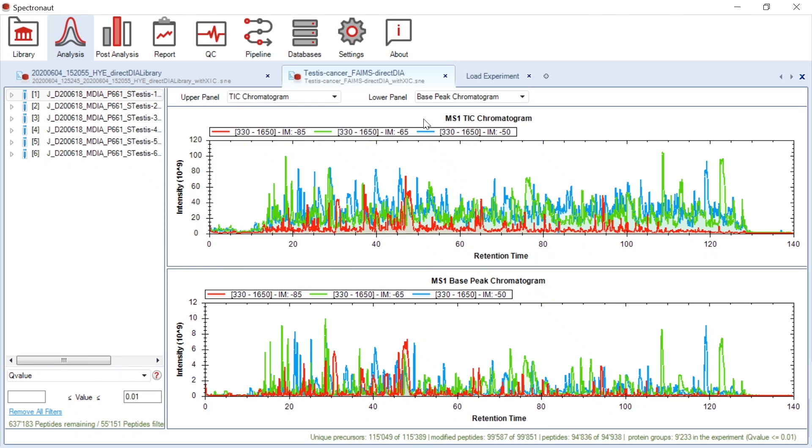We could see that application of different CVs not only removes contaminants from the sample, but also leads to the separation of ions, therefore leading to deeper proteome coverage.